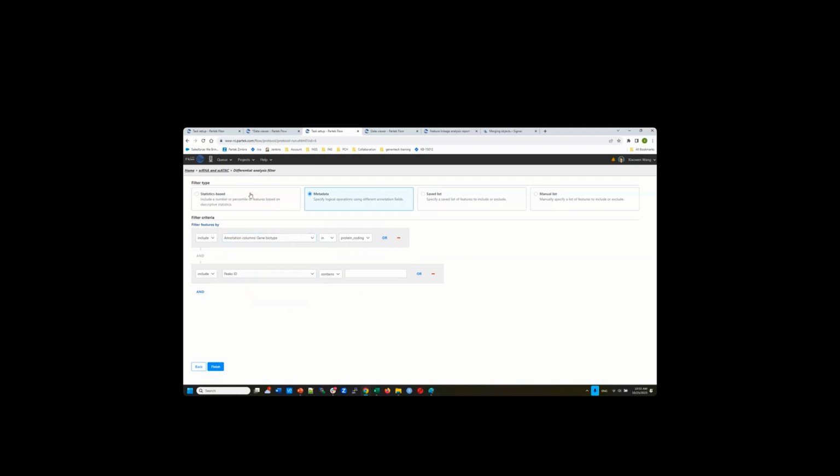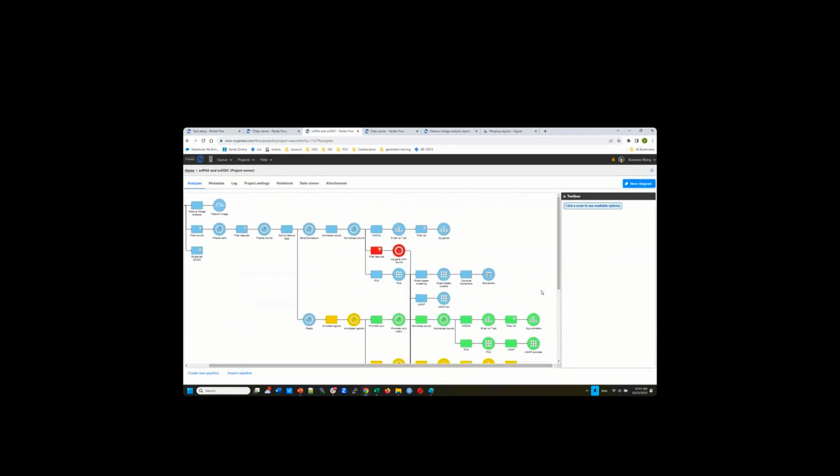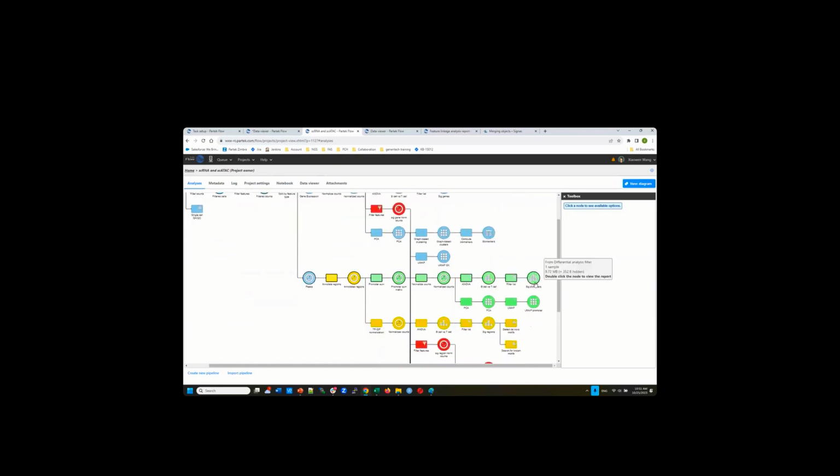Okay, so I just want to tell you, you can perform the filter to generate a significant list. So here, I generate a significant list of genes. I compare B cells versus T cells. Since I only have one sample, I only compare the cell type. This is the significant genes list, and this is a significant promoter list.